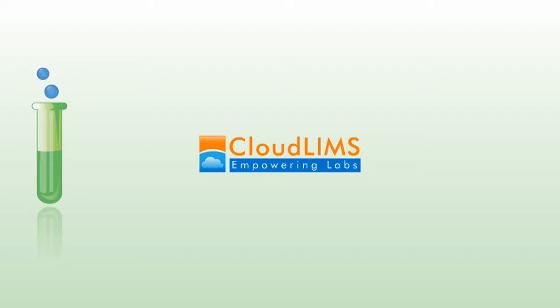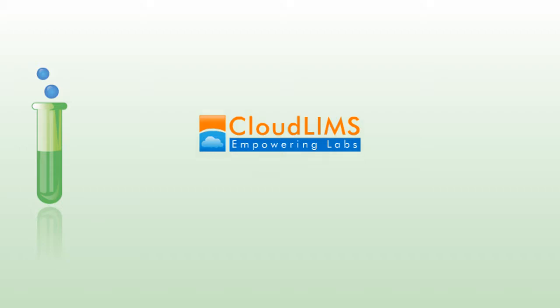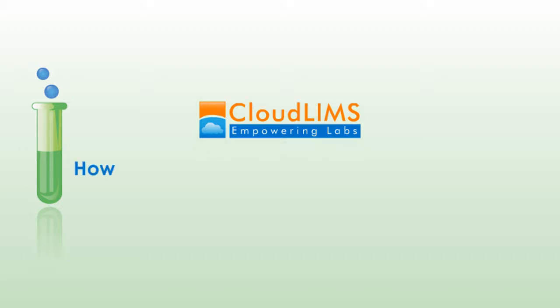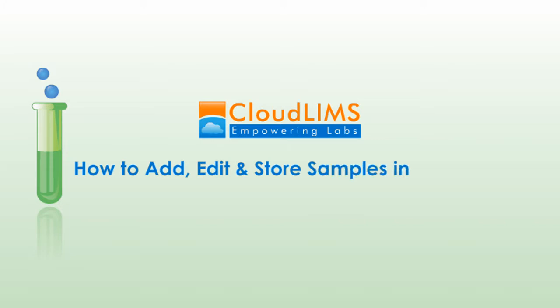Hi, in this video we will show you how to add, edit, and store samples in a batch.